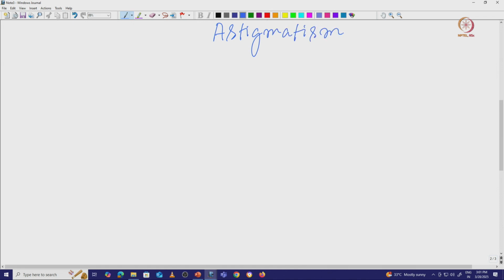What is this astigmatism? As I mentioned, it is an off axis aberration. Let us draw the optical axis first, as we mentioned it is always better to draw the optical axis. So we have this optical axis, and then we have that image. Now if we consider that rays are coming, and this is our lens system, the rays will go through the center point and form an image, and we are going to draw that here.